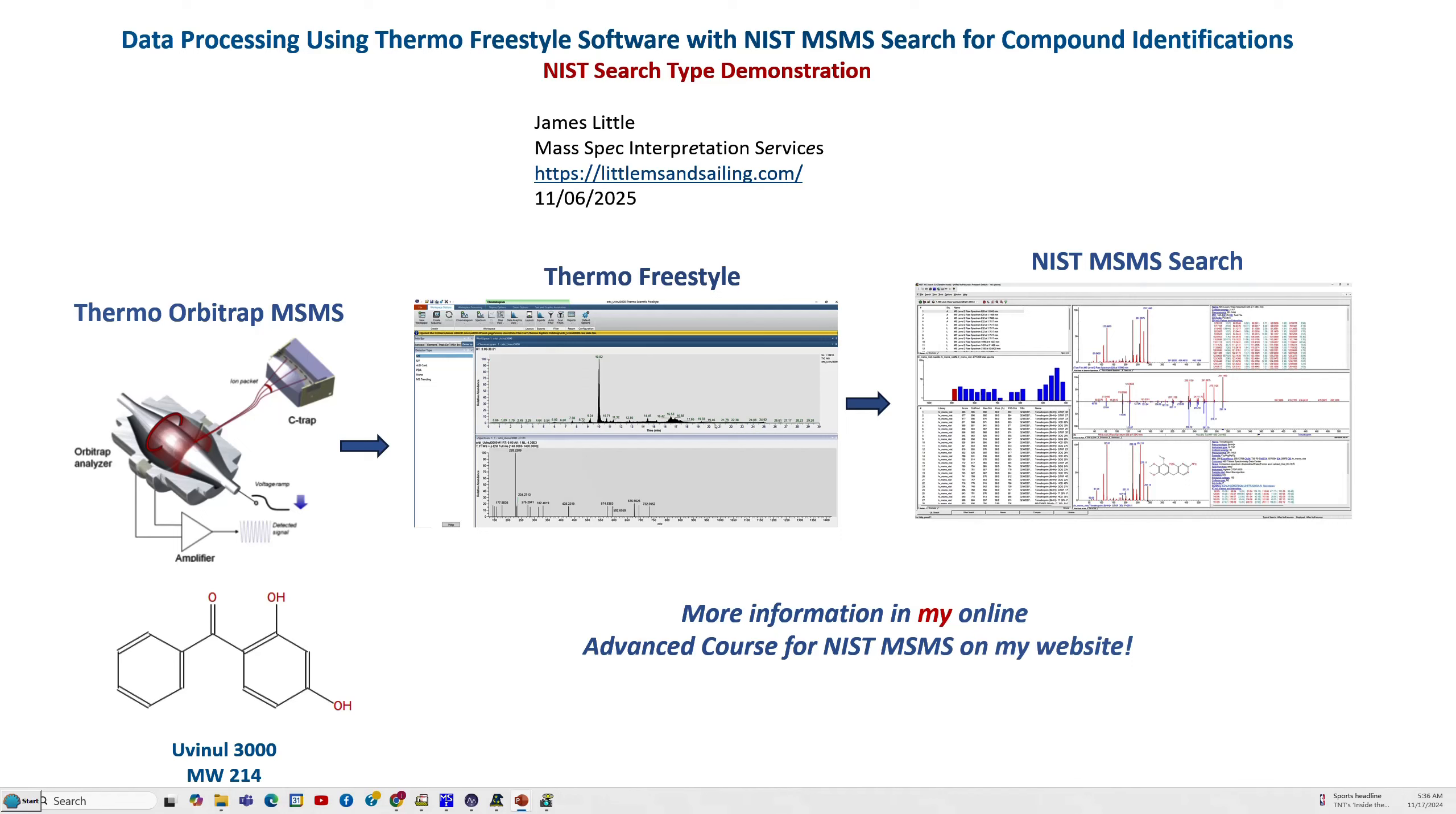This particular video discusses the NIST search type demonstration of using the software. There's several different types of searches when you take it to the NIST search and I'll just walk through some of them to give you an example of how they work. It'll be somewhat complicated so if you really want to learn how to use it I would suggest that you go for more information here in the bottom in my online advanced course for NIST MS-MS on my website.